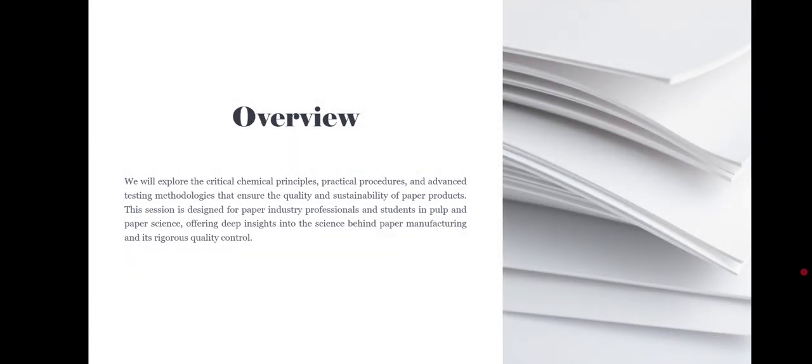Here is a brief outline of what this presentation will cover. In this presentation, we will explore the chemical foundations of paper, practical lab procedures, and various industry standard testing techniques. Whether for packaging, publishing, or environmental compliance, these tests form the backbone of quality assurance in the paper industry.